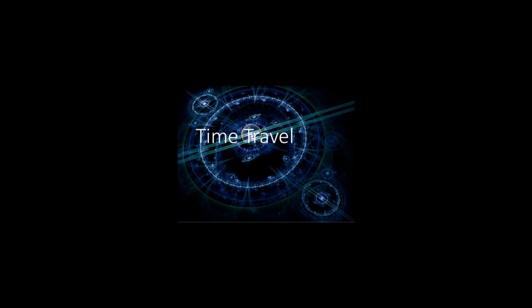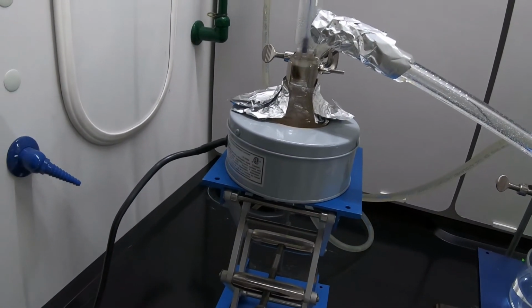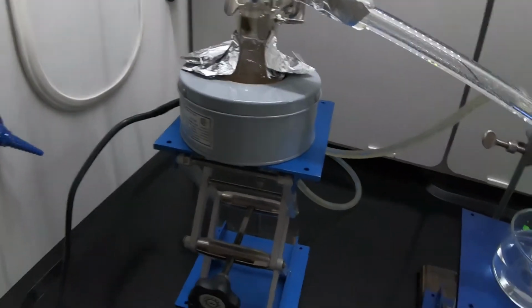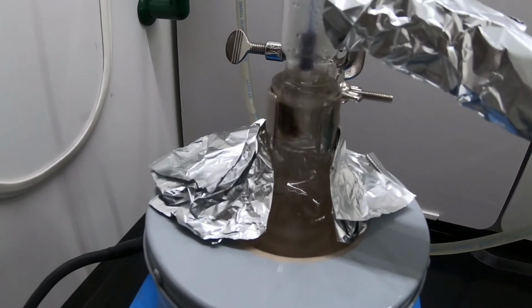Time travel. Okay, we're 12 minutes in now, so 5 minutes warming, an additional 7 minutes of heating, and we have active boiling. The coloration, I don't know if that's coming through, but it is absolutely boiling.